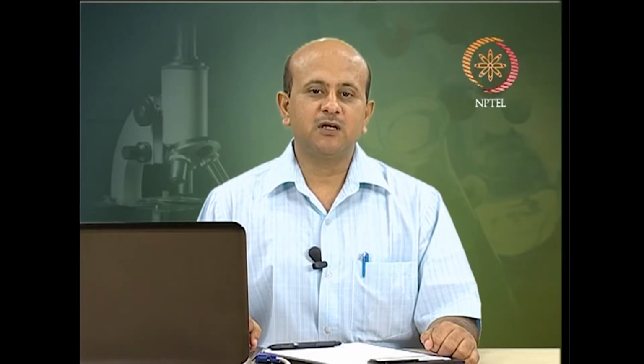Using an optical chopper such as a sector mirror, the reference and sample beams are alternately focused on the detector, and commonly the change of IR radiation intensity due to absorption by the sample is detected as an off-null signal that is translated into the recorder response through the actions of synchronous motors.